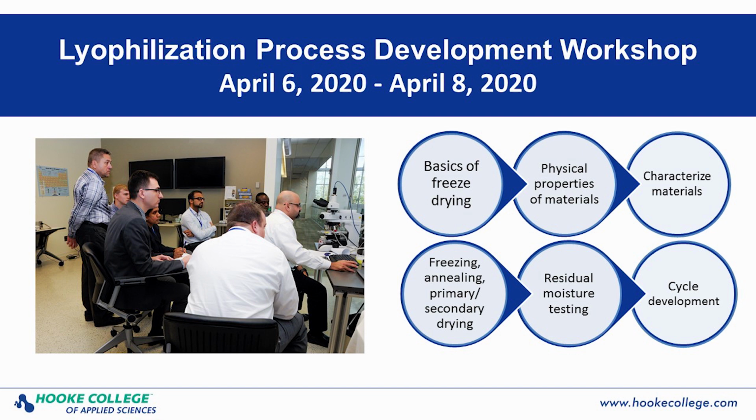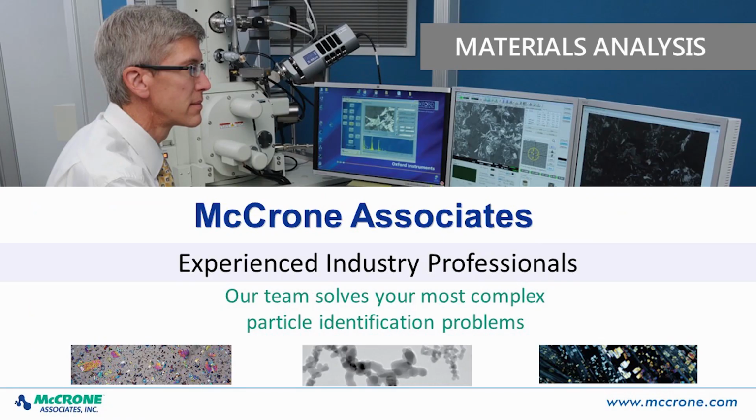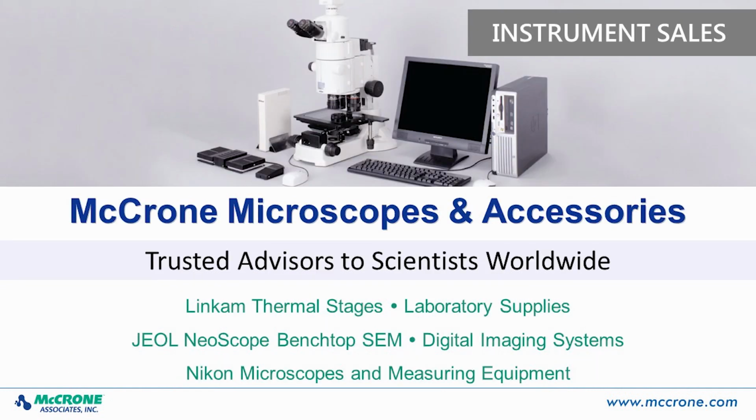But it is something that's definitely not as easy without the ability of controlled nucleation, which is something in the industry right now where a lot of productions on the production side don't have controlled nucleation available, so it's tough to try to develop a cycle using controlled nucleation.